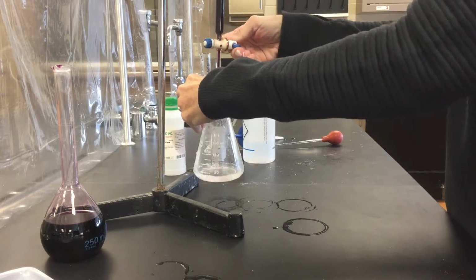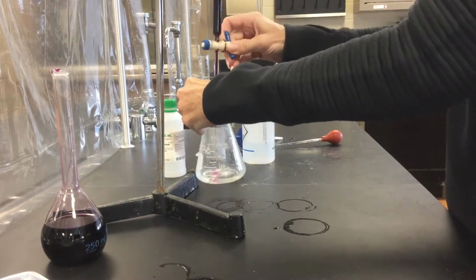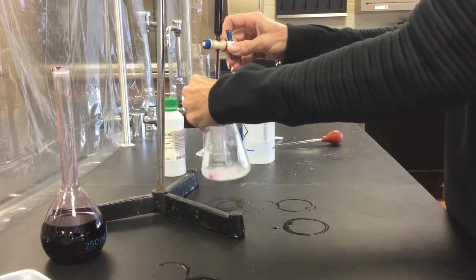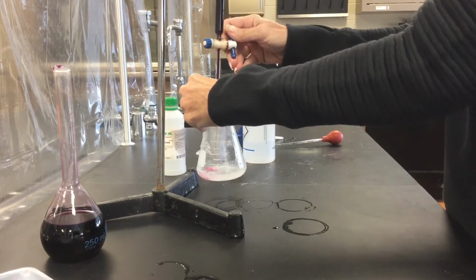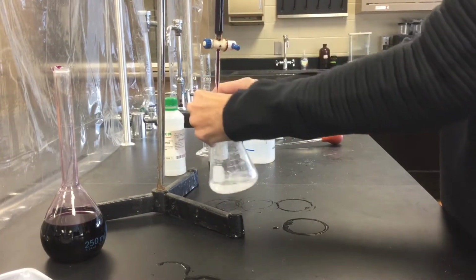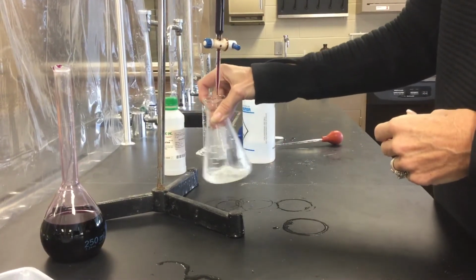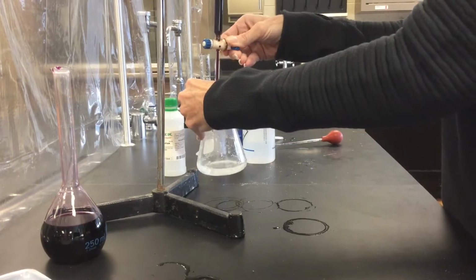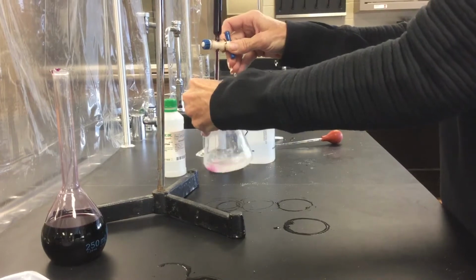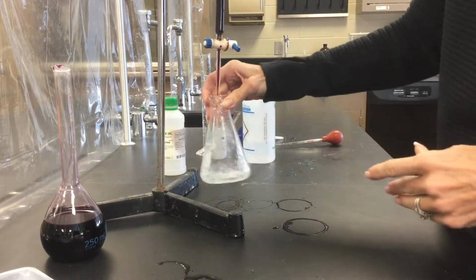now you can see we've got some bubbling going on here as the reaction's taking place. As the hydrogen peroxide is reacting with the potassium permanganate, we've got gas forming.